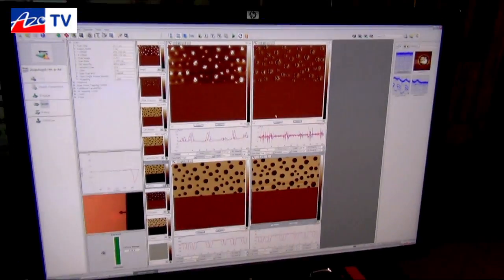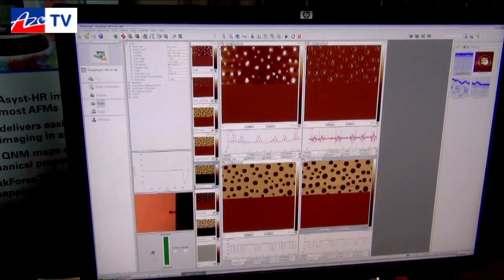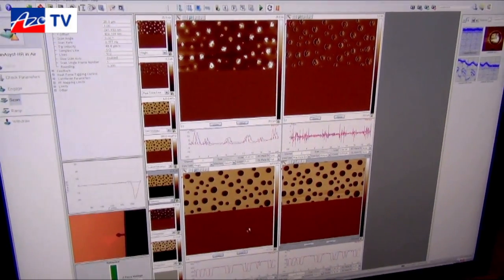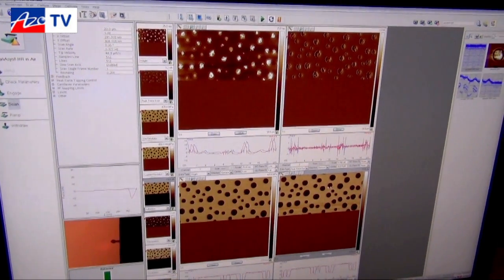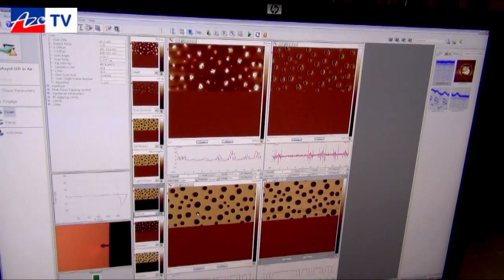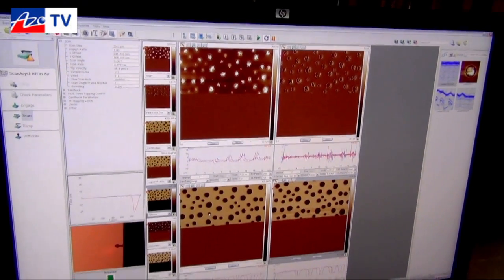If I minimise this, this is what you see behind. In this channel you have the topography or the height image, here we've got the error signal, and at the bottom — again in real time with the same resolution — we're getting the modulus calibrated with the cantilevers and also the adhesion channel. We can very easily distinguish between the two different polymers and their different mechanical properties in real time. That's one of the advantages of Peak Force Tapping.